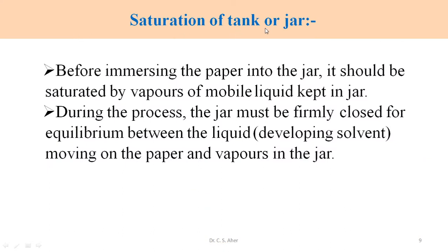The second point is saturation of the tank or jar. Before immersing the Whatman filter paper into the jar, it should be saturated by vapors of the mobile liquid that we have taken in the jar. The tank must be saturated with vapors, meaning in the gaseous phase. So we cover the volatile liquid with a lid, and the tank gets saturated.